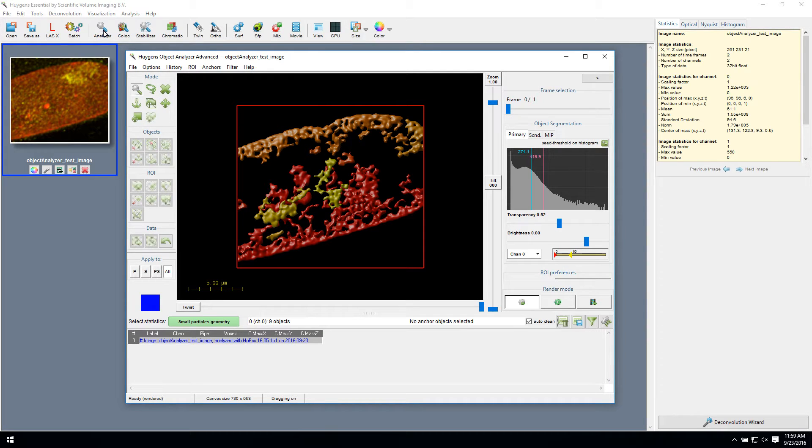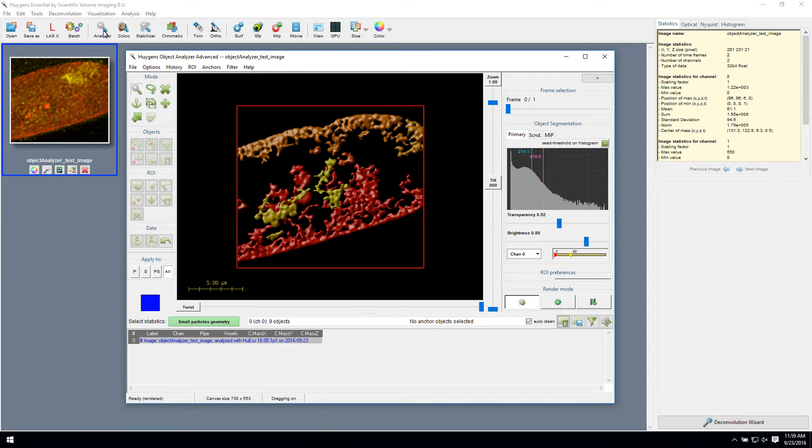Now you are ready to get your statistics. You can get these by clicking on an object when the magnifying glass mouse mode is enabled, or by clicking Analyze All on the top right of the statistics table.